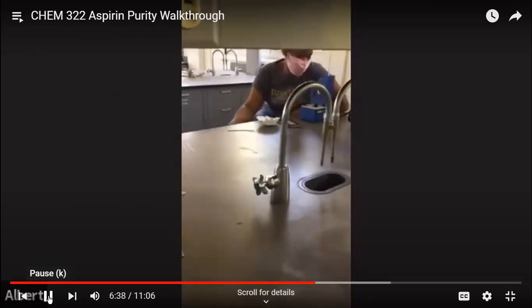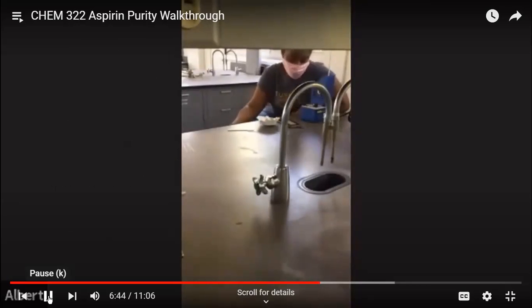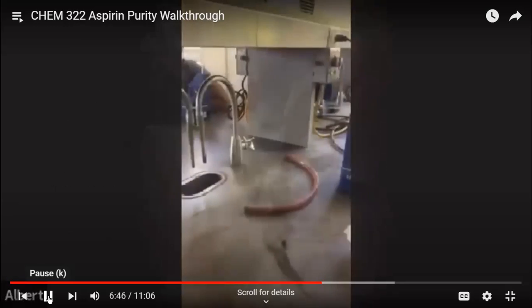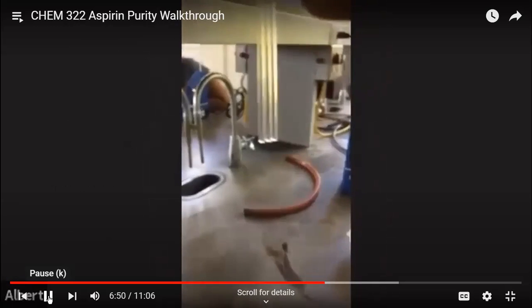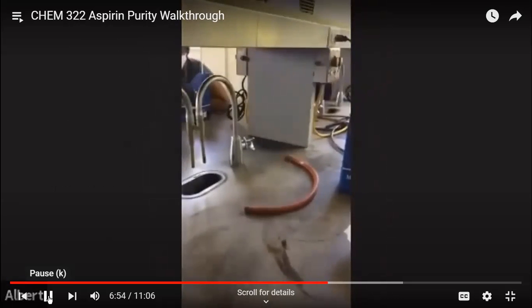That way it'll slow down the temperature increase, because once you get to about 20 degrees out, you want to increase the temperature about 2 degrees per minute. This is very tedious and time consuming. So we've got 3 melting point capillaries, and we're going to put some sample into these. I'm going to take one of them and put some crude in it for each.